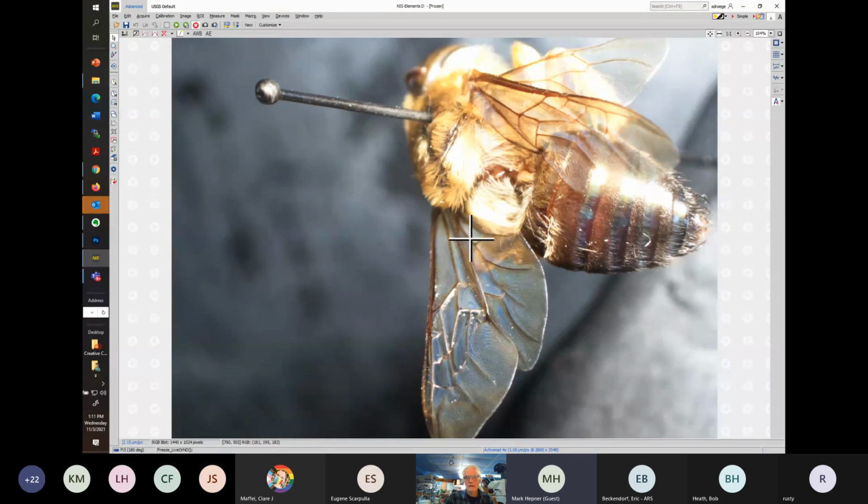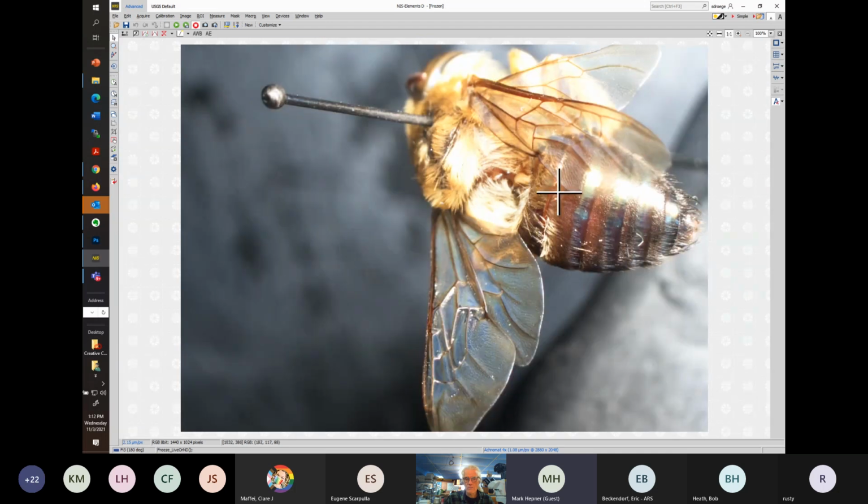When we're looking at the wings, if we look at the wings more closely, oops, did I freeze? Looks like my screen is frozen here. I did hit something. Everyone should be frozen since mine is frozen. You can see I can move the cursor. All right, I can move the cursor, but when I move, I have moved the specimen.